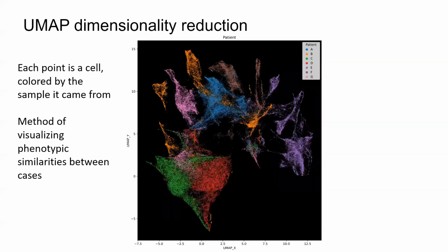And finally, we can perform a little bit of dimensionality reduction. So let's say we have 28 different markers in this panel. Well, we're going to have about 4 different measurements corresponding to the distinct cellular subcompartments, multiplied by 5 different descriptive statistics relating to those measurements. And you might end up with a per cell statistic sheet consisting of thousands of different features.